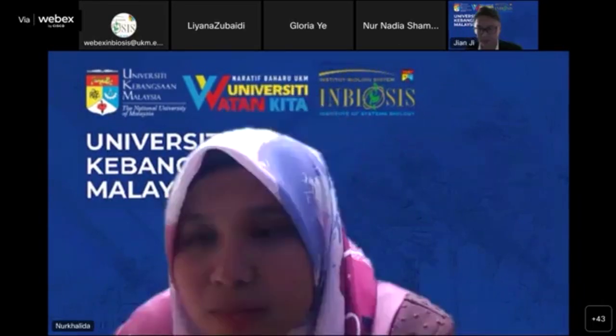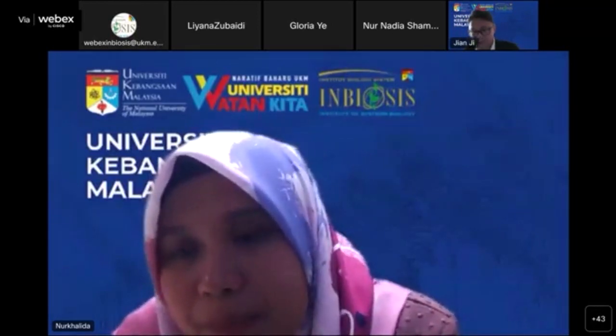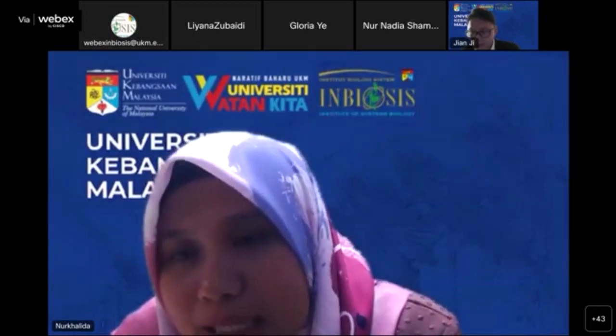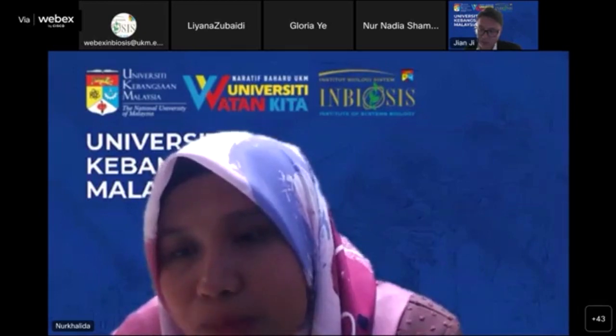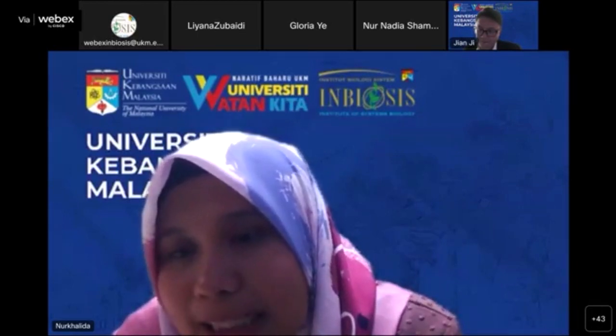Okay. Yeah. All right. We have a question from the Facebook from Akil Fitri. Thanks, Dr. Jian for an insightful presentation. Would you suggest a comprehensive way to have valid data when working on untargeted analysis? What needs to be filtered? Because compared to the targeted approach, it might be observable from the data since we target it. How about the untargeted?